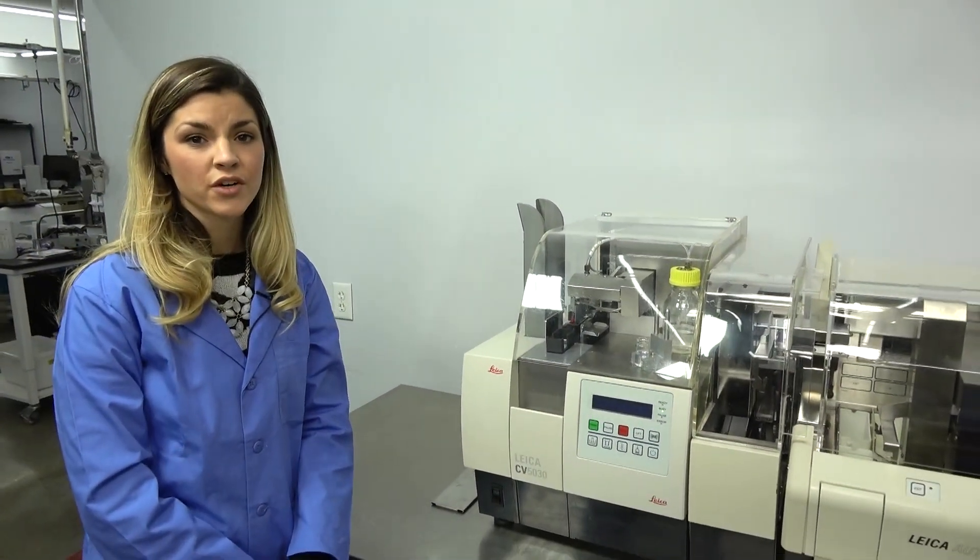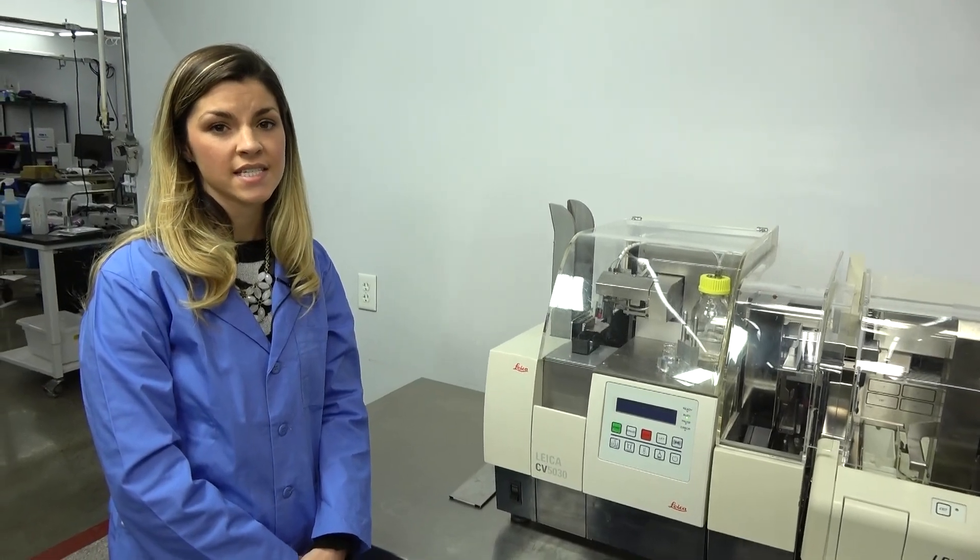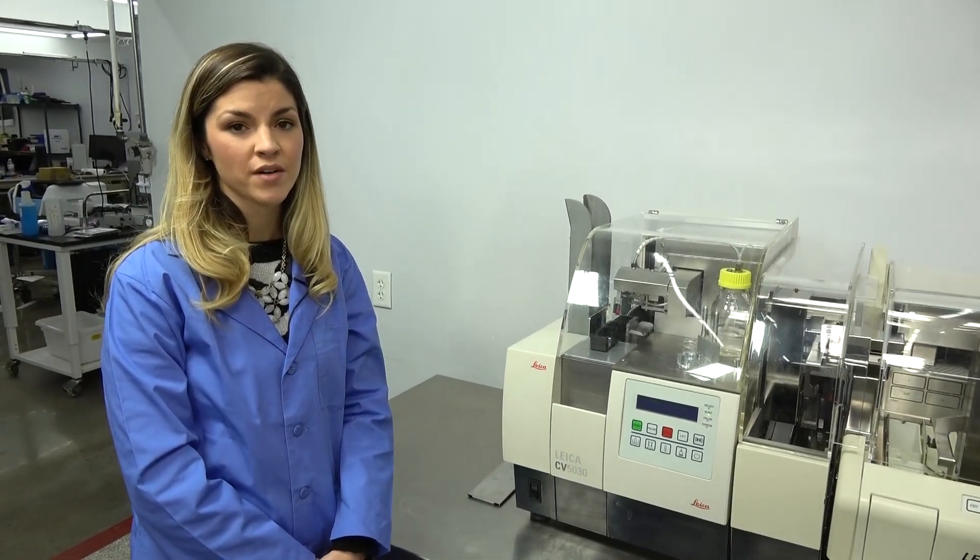This unit is available in our Cridersville facility. It has been tested by our technicians and it comes with our 90-day warranty.